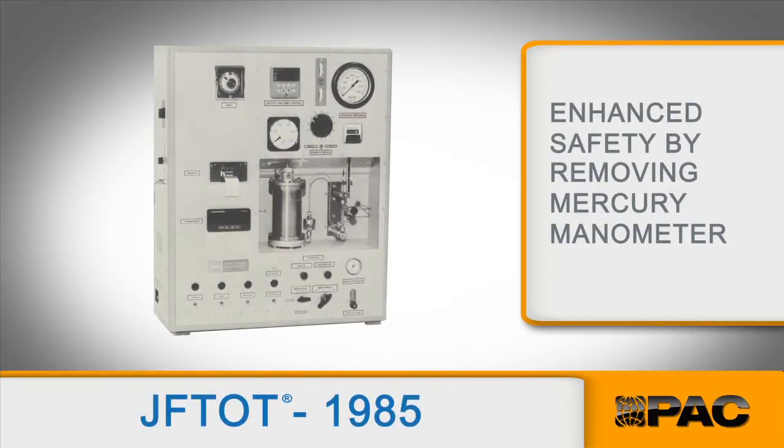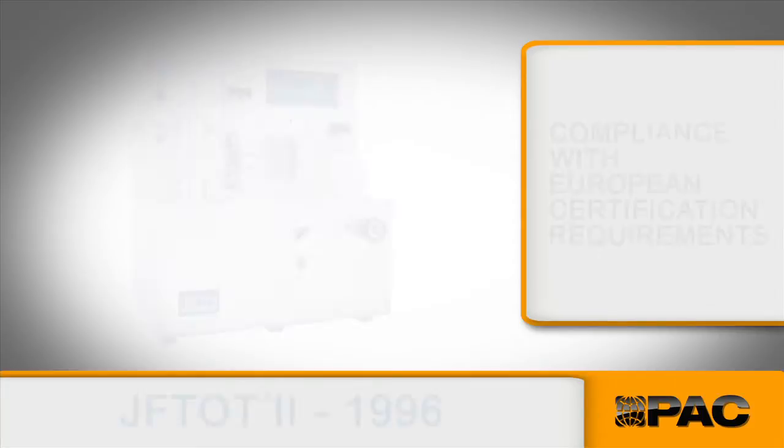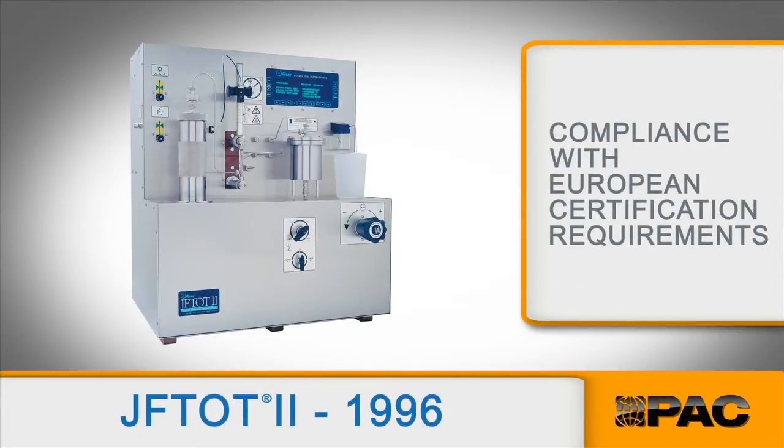In the past 40 years, you've seen the Jephtot develop from an instrument that met Air Force requirements to an ultra-enhanced, state-of-the-art innovation that features complete data integrity and top-of-the-line safety enhancements packaged in a small, easy-to-use analyzer that practically runs itself.